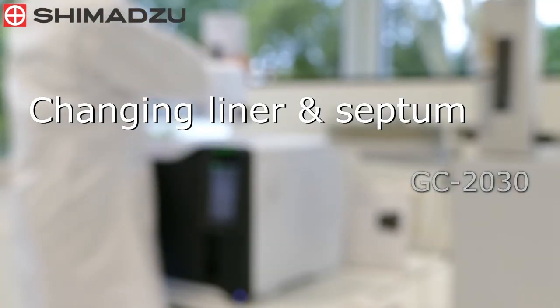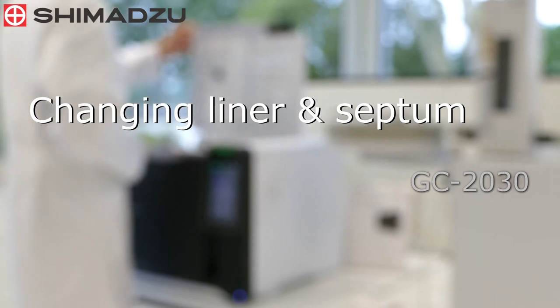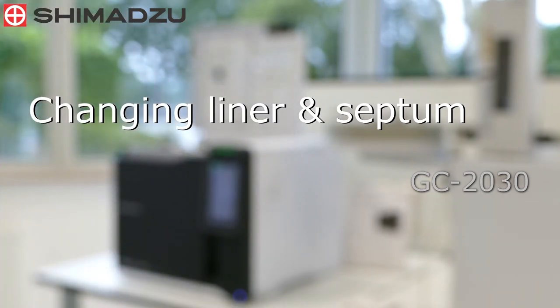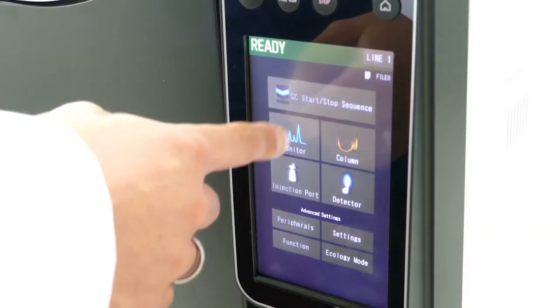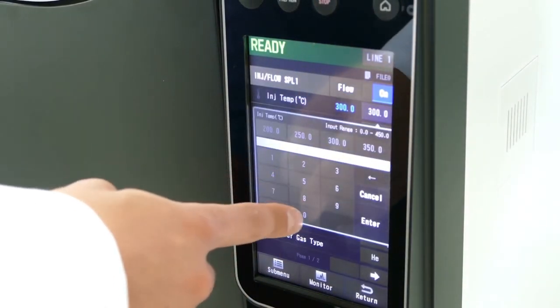After around 150 injections, it is necessary to exchange the septum as it can begin to leak. Each injection also begins to contaminate the liner, forming active sites. After the injector and the oven have cooled to below 50 degrees centigrade, maintenance can be started.